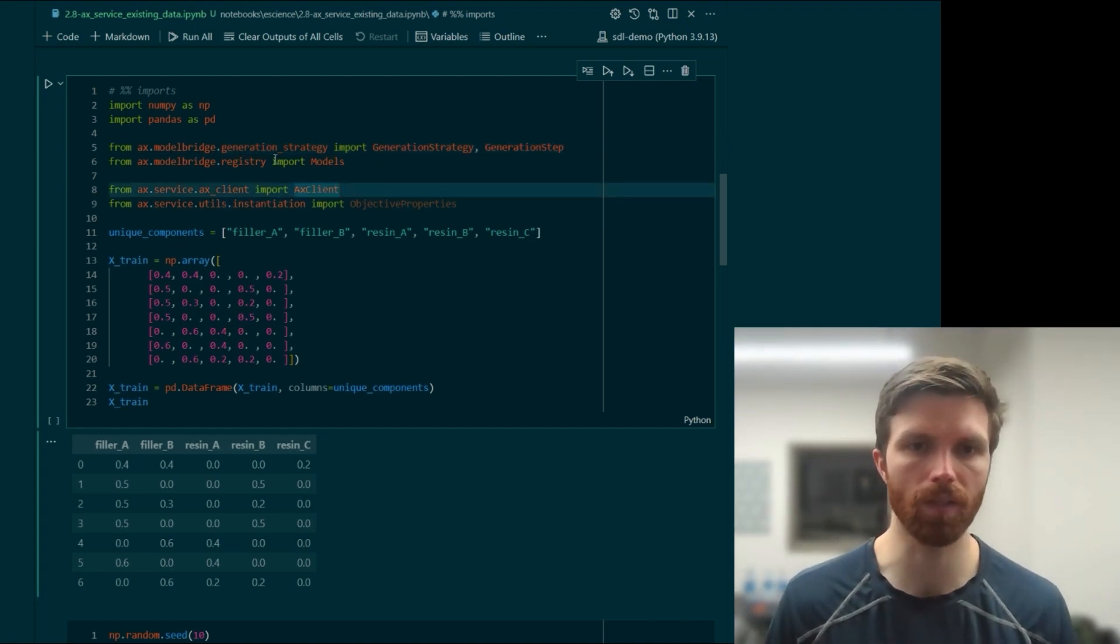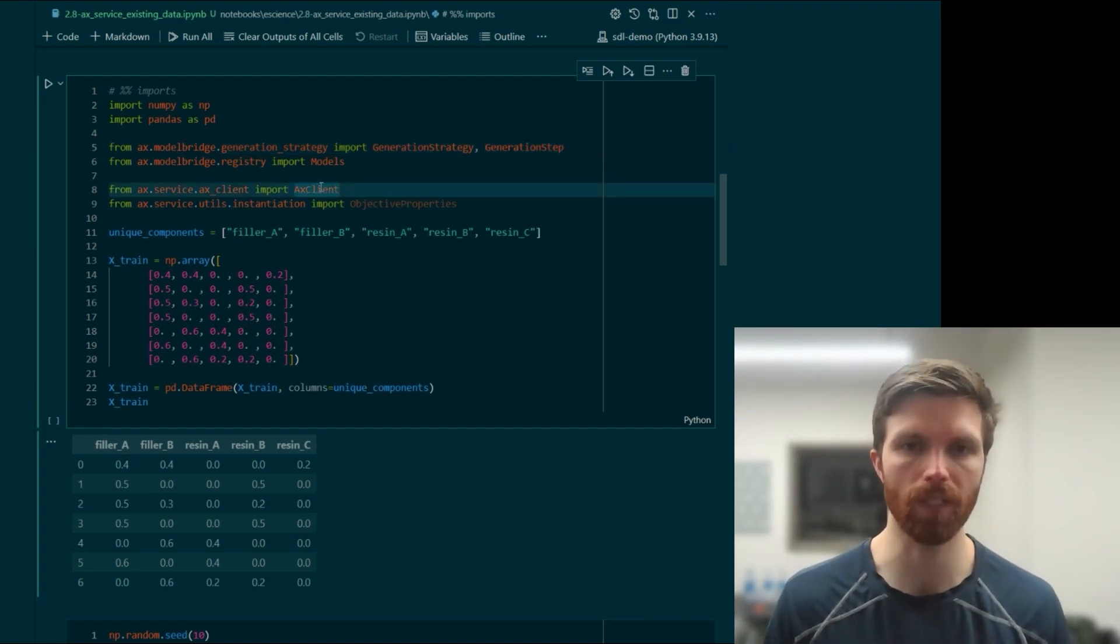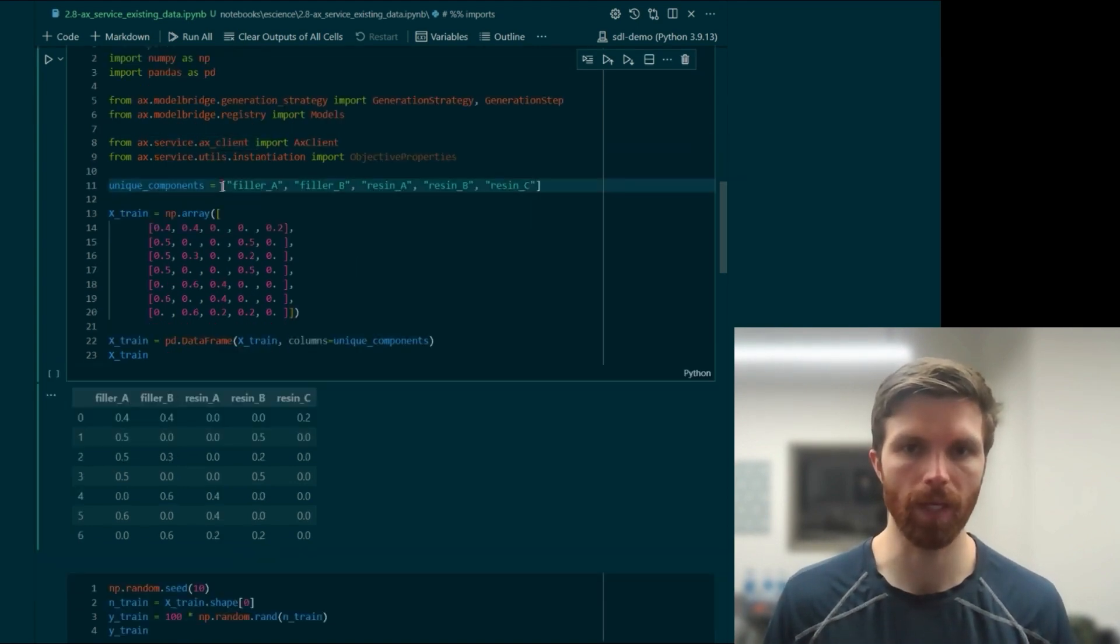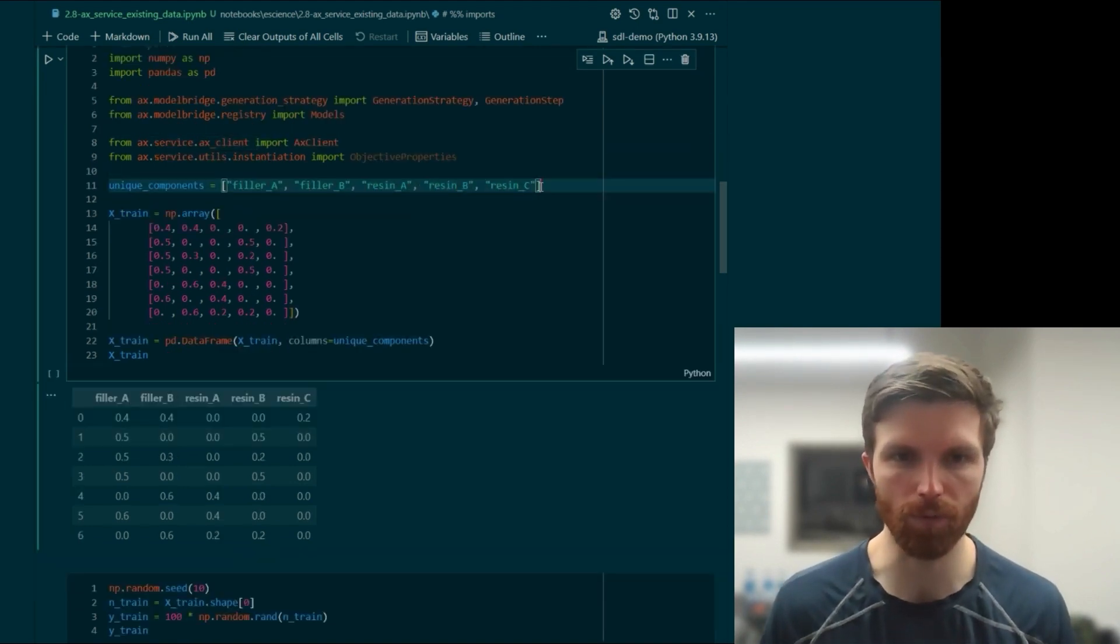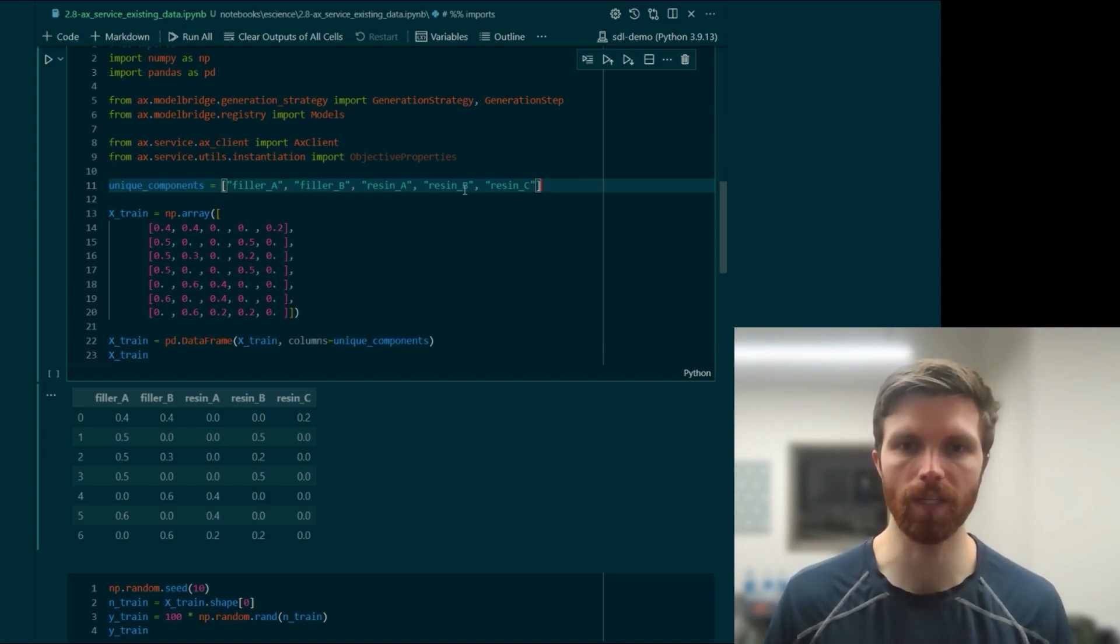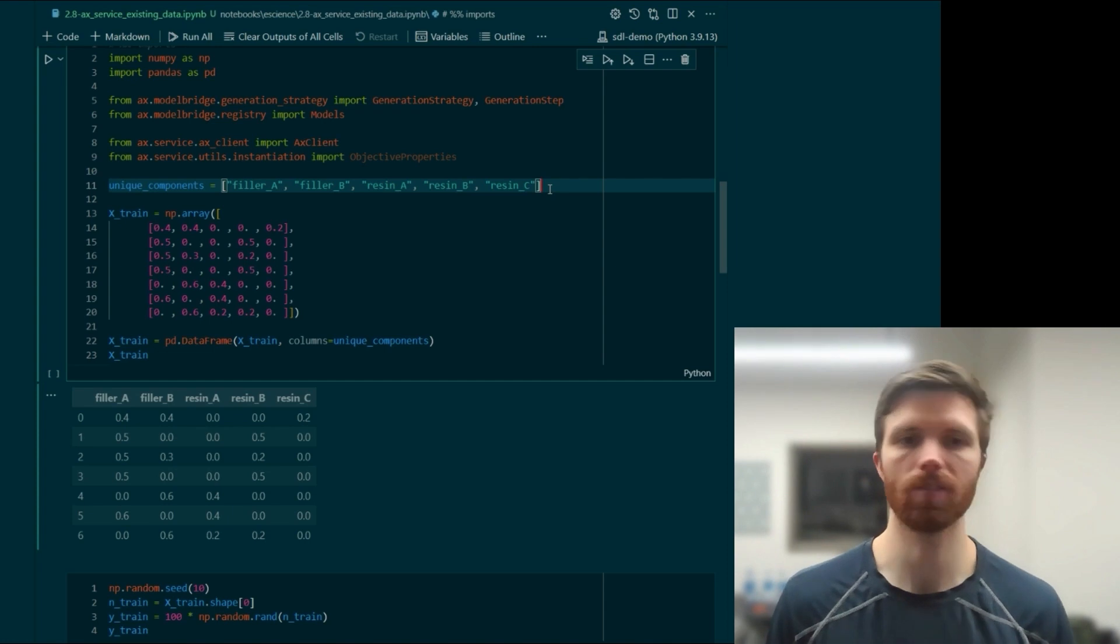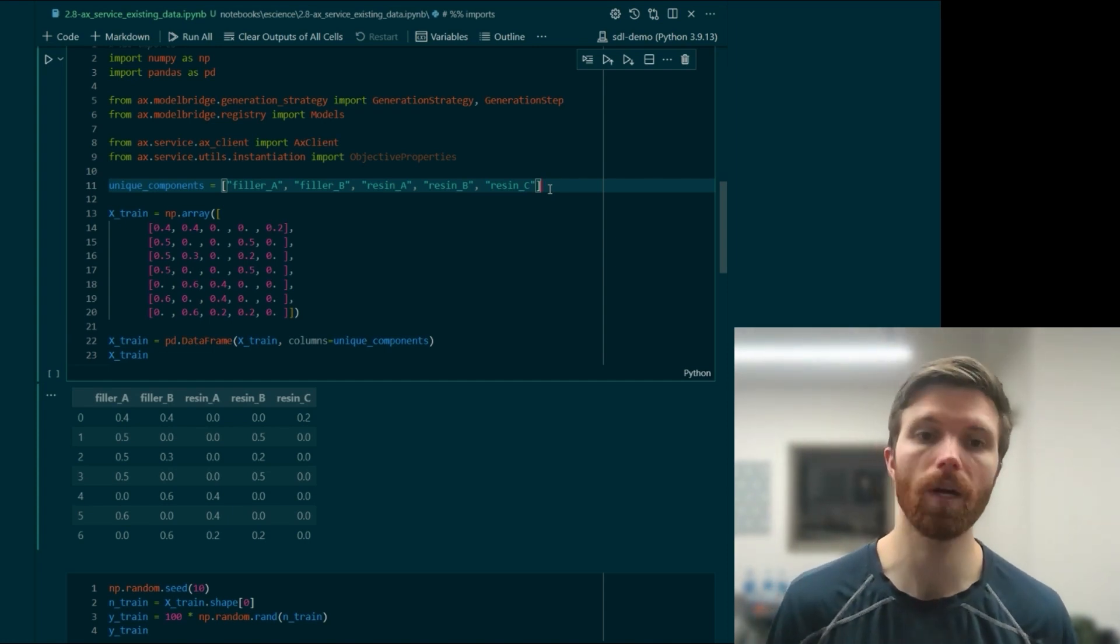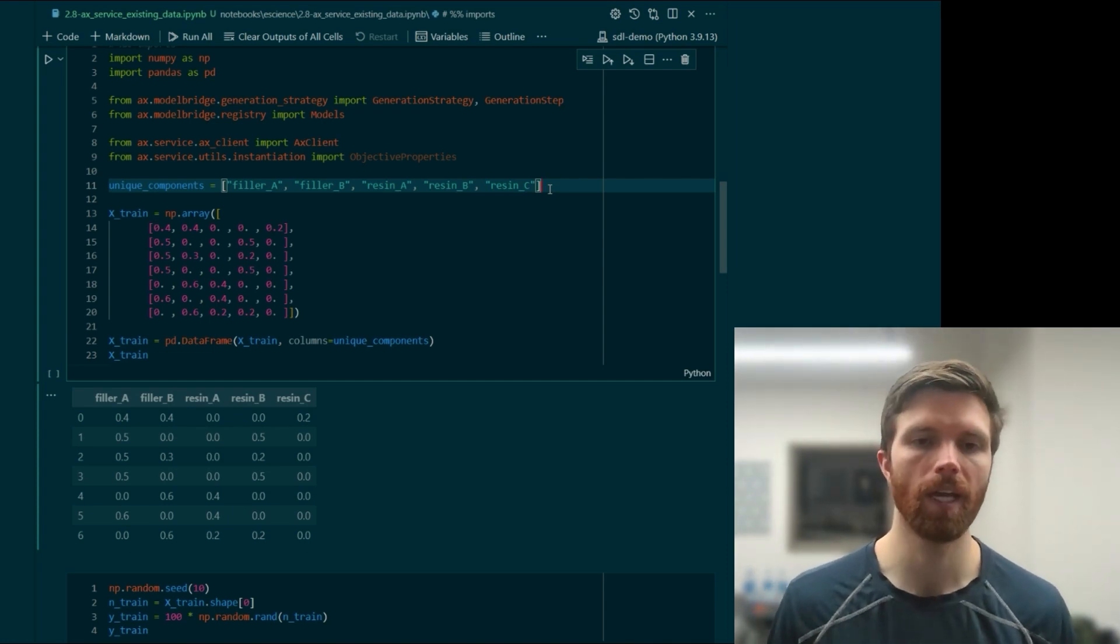Here we are using the service API, we'll use Ax client, and we have five different parameters here. We'll call them filler A, filler B, resin A, resin B, resin C, as if we're optimizing a composite material.